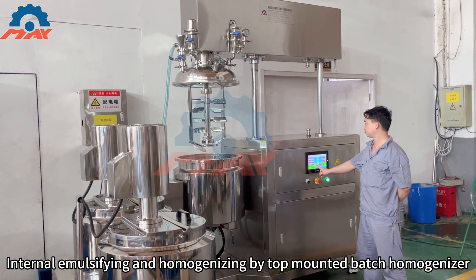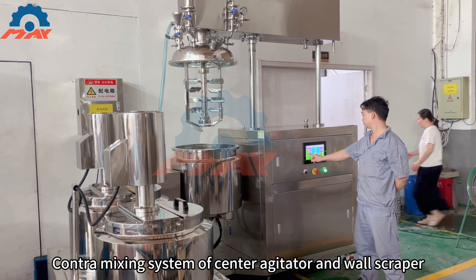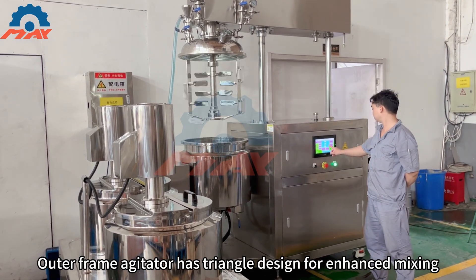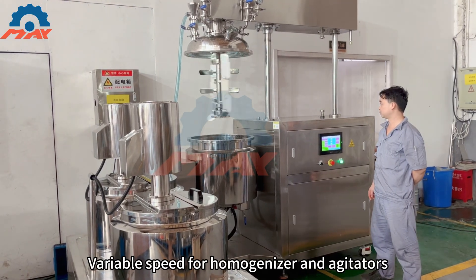Contra-mixing system of center agitator and wall scraper. Outer frame agitator has triangle design for enhanced mixing. Variable speed for homogenizer and agitators. Oil hydraulic lifting system for easy cleaning and maintenance.